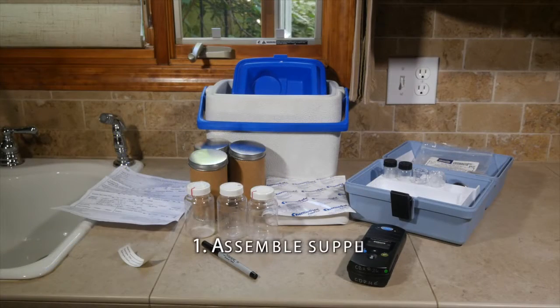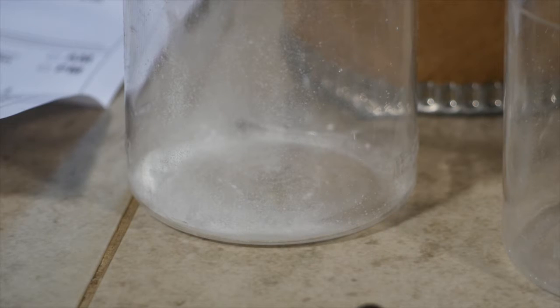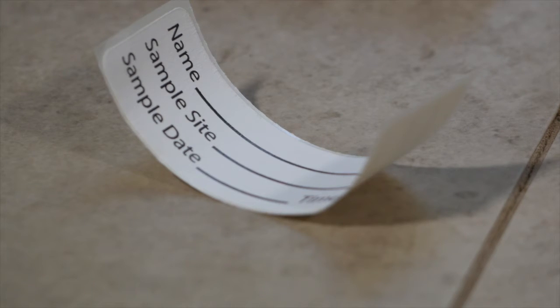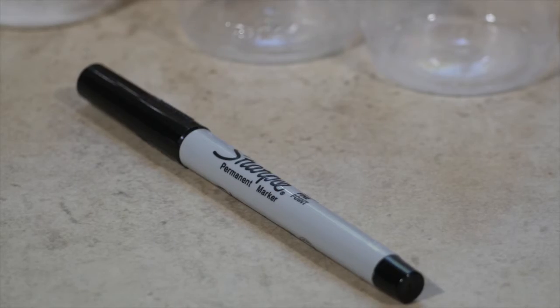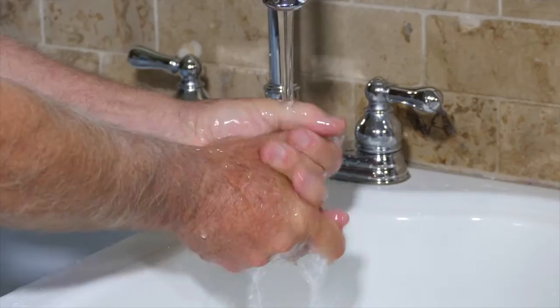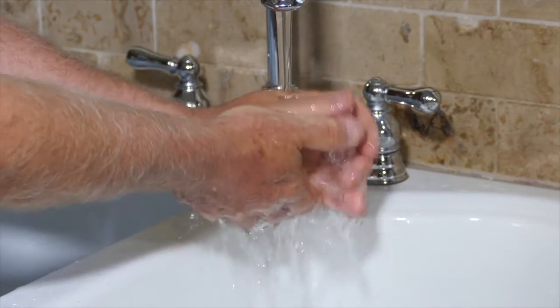Assemble the sampling supplies. These include several 125 milliliter sterilized plastic bottles that you get from the lab. The white powder in the bottom of the bottle is a dechlorination agent. Do not rinse out the bottles. The lab will supply a label and any forms that they require. Bring along waterproof pens or markers. Wash your hands thoroughly. If you wear gloves, make sure they are clean.